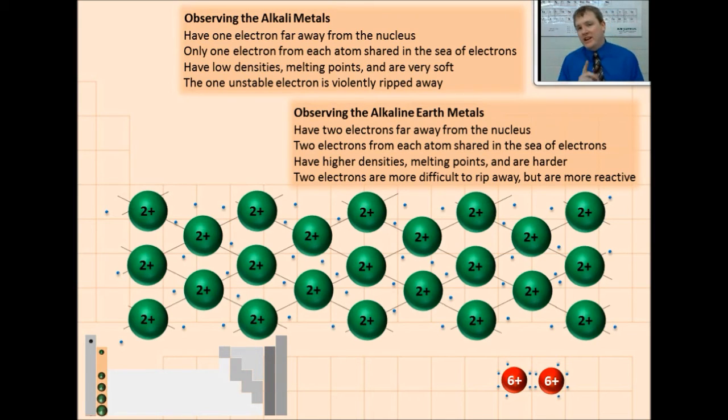But under the right conditions, we could even force a stable molecule to break apart and react because we're dealing with a very reactive metal substance. So how exactly does that work? Well, in order to make oxygen react with magnesium, I need to add a tremendous amount of energy to the magnesium. In this case, I'm going to do that by adding heat energy over a burner flame.